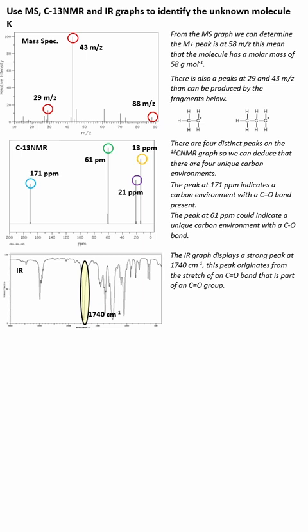Because that stretch is present, it means there must be a carbon double bond oxygen group in this molecule. The other peak we see here, we're just going to label, but this is going to be present in most molecules you look at, and that's the carbon-hydrogen stretch at around 3000. We usually don't use this to identify specific structures because just about all the molecules we look at do have carbon hydrogens. But if there's an absence of it, we can say that there's not a carbon hydrogen bond.